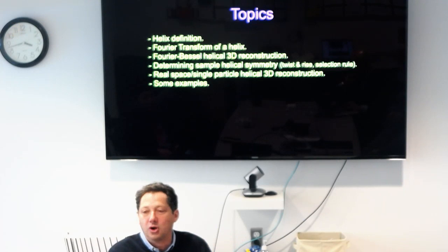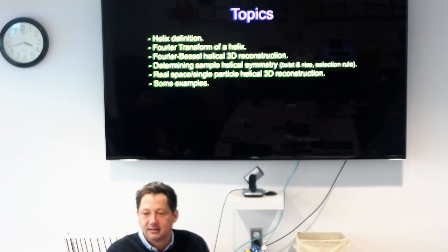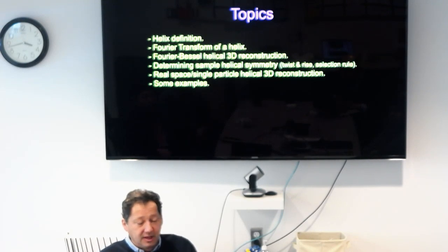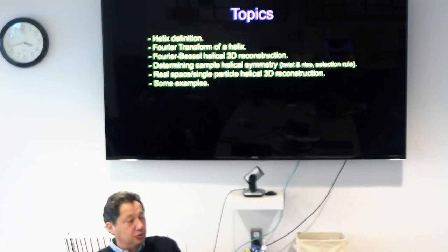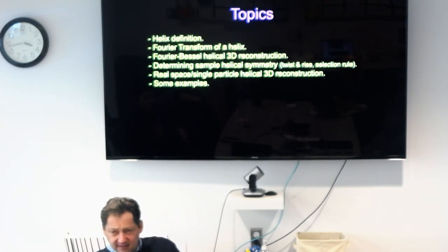But it's good to know, if anything, for historical reasons, and also because it helps you understand, when you see a diffraction pattern of a helix, why that is the diffraction pattern of a helix and what information you can get out of it. Okay? If you ever end up with a helical specimen, most likely you don't just say, oh, it's helical, I'm done. Well, whatever method you use, you're still going to need to find what the parameters of this helix are.